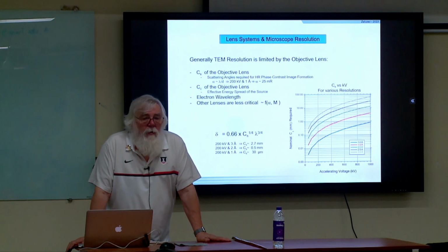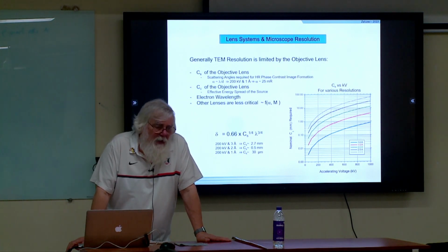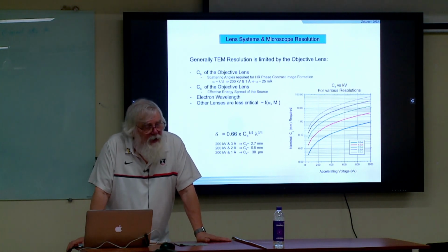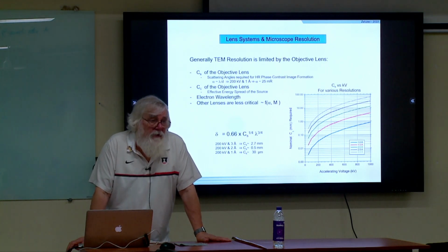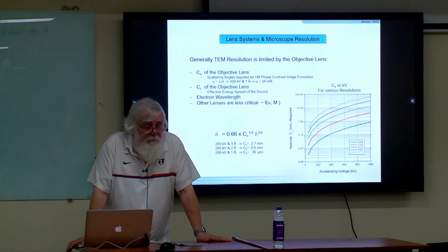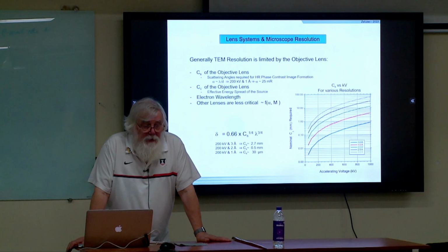Okay? So you would start with, original microscopes tended to run around 100 kilovolts, and then they started to go to 200 kilovolts, then 300 kilovolts, then 1,000,000 volts, and there's actually a 3,000,000 volt microscope. Okay, the 3,000,000 volt is still in Japan right now. Okay, there are very few 1,000,000 volt microscopes anymore. Most of those have been retired, I guess is right, or decommissioned, right. There's still 1,000,000 volt microscopes in Japan.